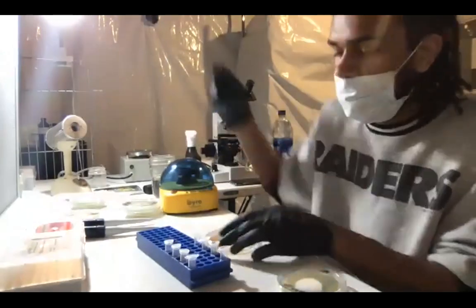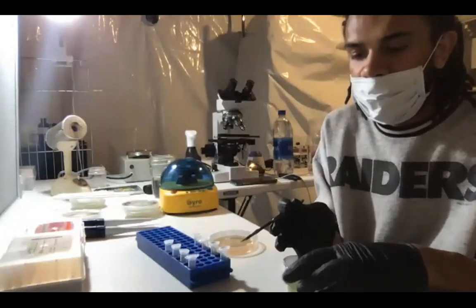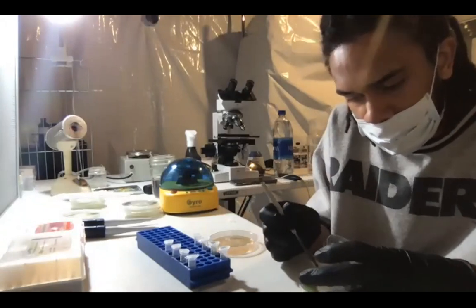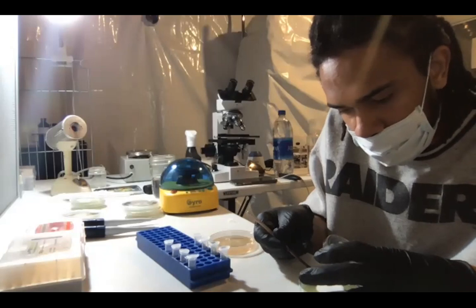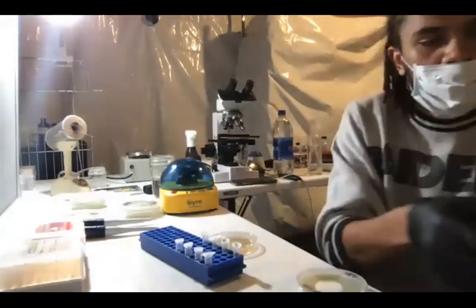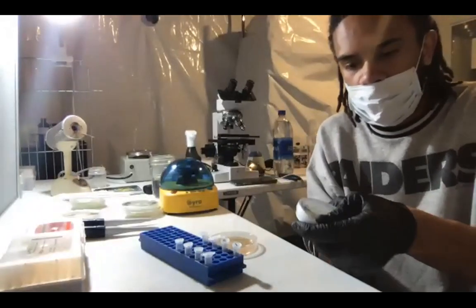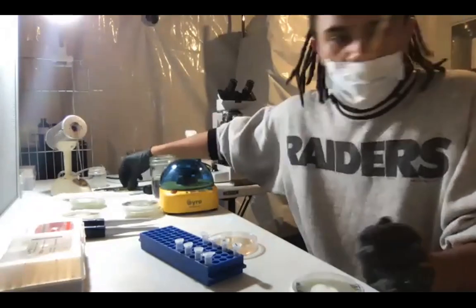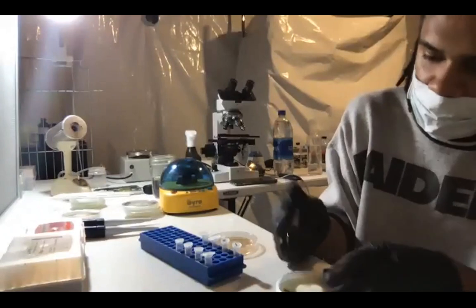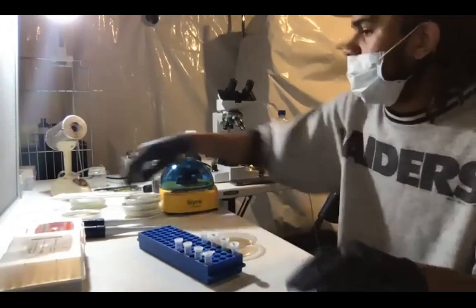I'm going to sterilize this scalpel one more time and cool it down. If you don't cool down your scalpel, you'll kill your mycelium and you'll damage the DNA, so you're not going to get a good read off of it. Mark that number three. And I'm on to the last one now.